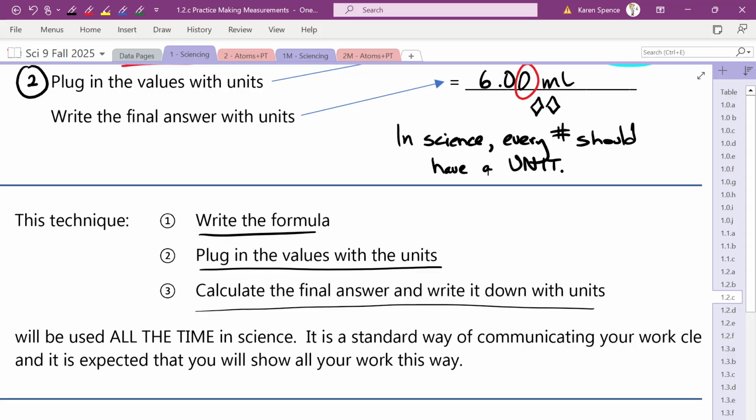Okay. You will be working with a partner. If you are in a group of 3, you can choose to have 1 burette set up or 2 burettes set up. Up to you. It just will take a little longer because I want each person to do it individually.